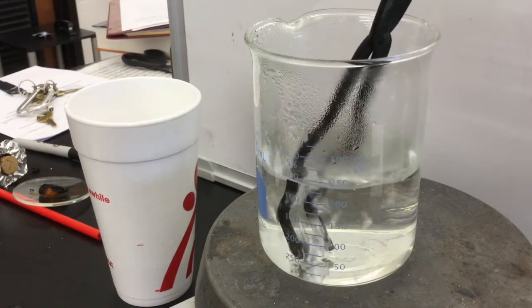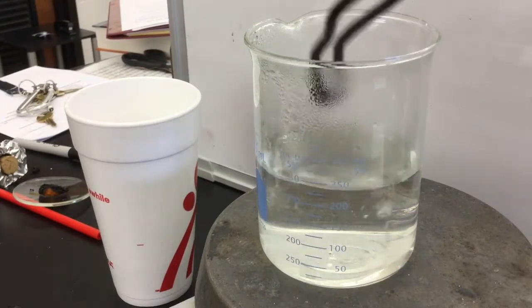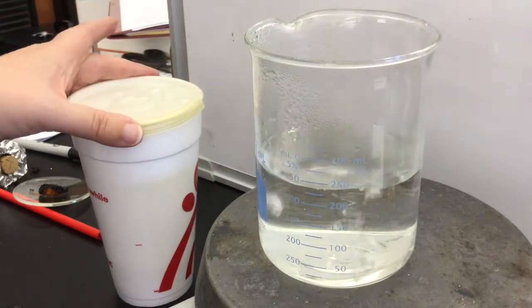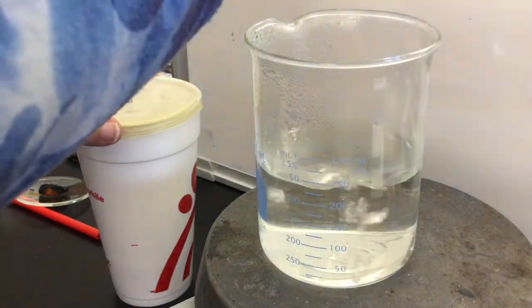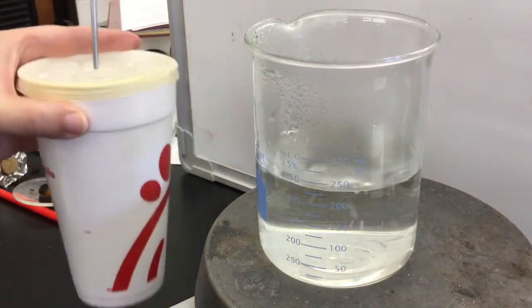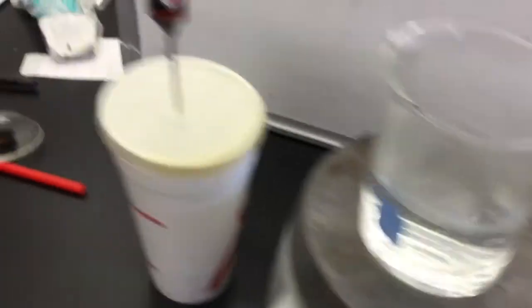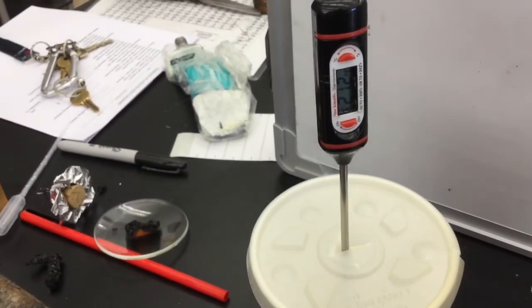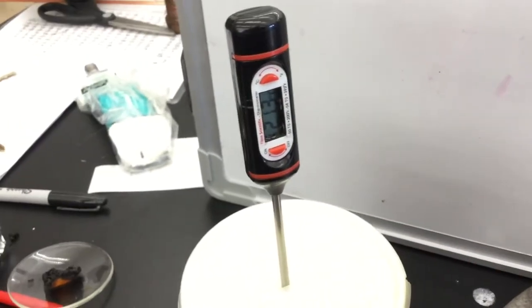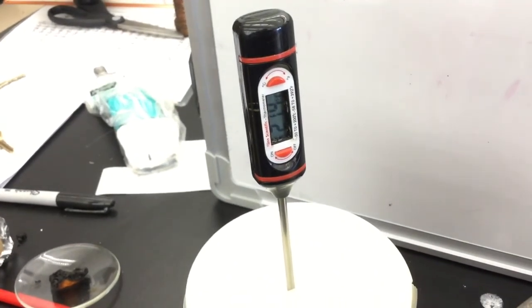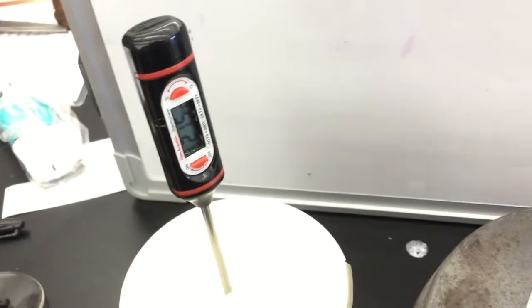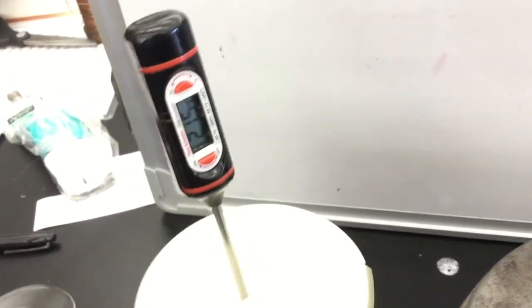Transfer the metal piece to the styrofoam cup and quickly replace the lid and add the thermometer. The temperature change will take up to 30 seconds but you should see the final temperature within a minute of adding your thermometer. Record only the highest temperature as your final temperature. The final temperature of the water is the same as the final temperature of the metal.